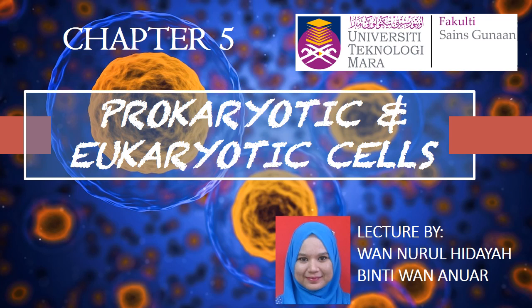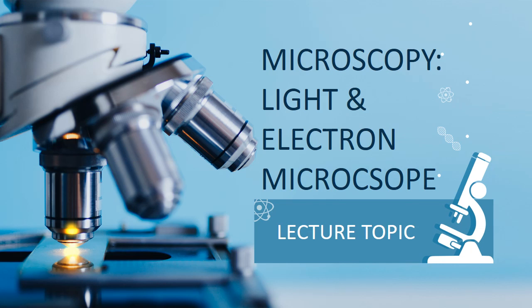Alright, in this video, I will discuss chapter 5, titled Prokaryotic and Eukaryotic Cells. By the way, my name is Madam Nurul Hidayah binti Wan Anuar, and I will talk about the first subtopic for this chapter. The first subtopic is microscopy. Basically, there are two types of microscopes that will be discussed: the light microscope and the electron microscope. Let's start.